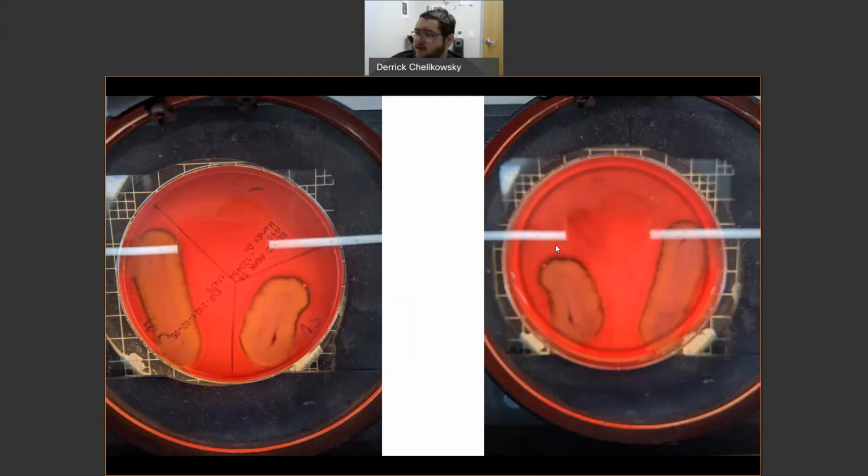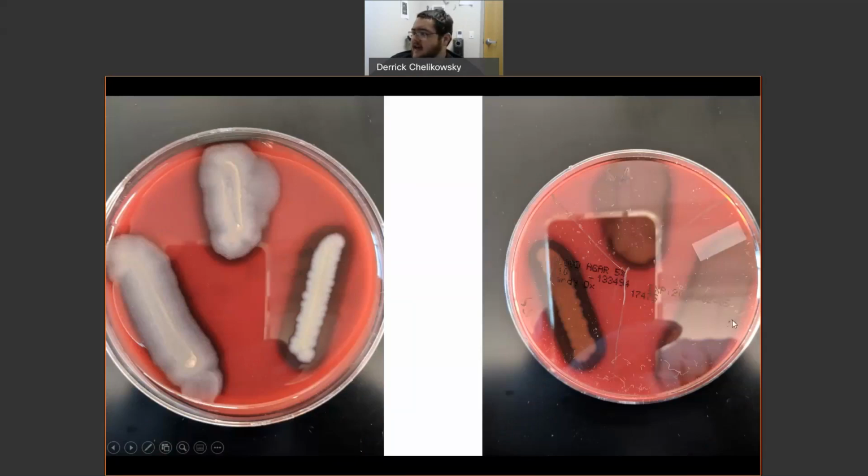And what we're seeing here on the plate reader, you can see this large band of green, which is exactly what you're looking for on the Streptococcus. This large area of a dull green on the outside of a colony growth, which is right in the center. Now this is without light, and as you can see, it's much more difficult to see, though you are able to see here this zone of beta hemolysis, of full hemolysis, but you really don't see any color here. This is why we have the plate reader, because it allows that green to pop, and you're really able to see that green hemolysis as part of the alpha partial hemolysis. And you can easily see the beta hemolysis right on there.